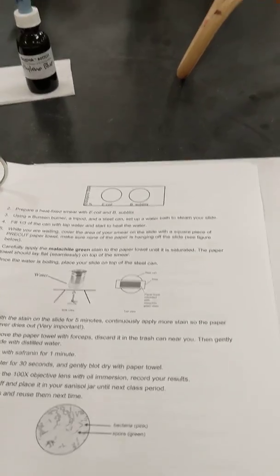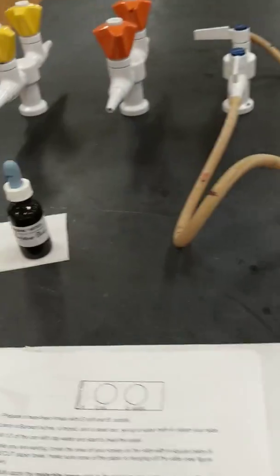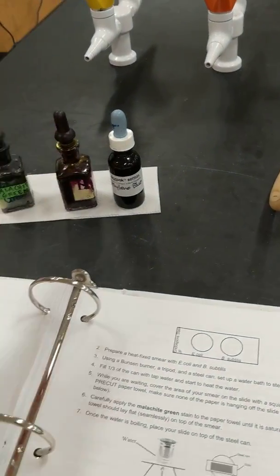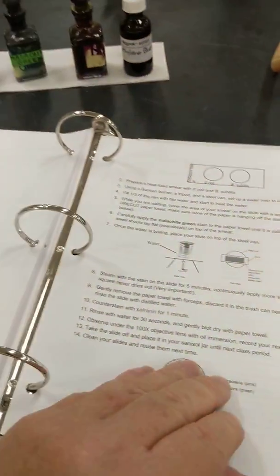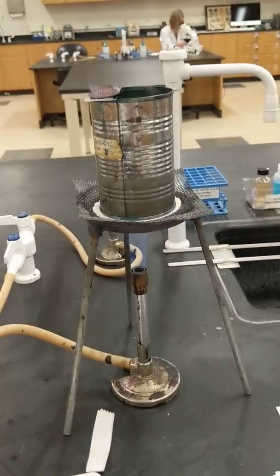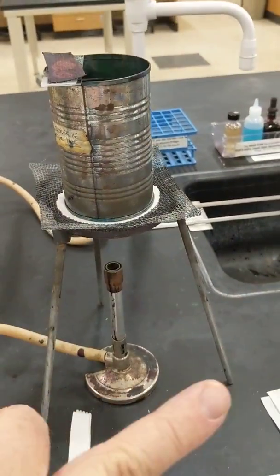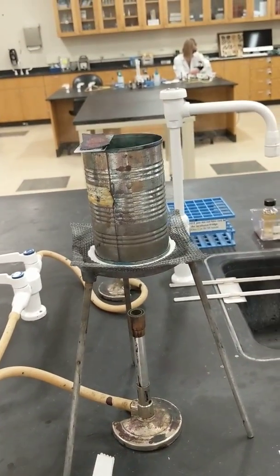Okay, and then when you're done with that, you're going to counter stain it. Again, you have your materials here. I'd recommend putting all of your additional stains in one area on a piece of paper, so that you can quickly clean up any spills. You would have a work area, you have your materials in here, and then you would have your instructions, whether you're using a laptop or your phone or whatever, have everything all set. All right? And then once you're done with this, you will turn off your flame, let it cool off, dump the water in the sink, and then go ahead and put the materials away. I hope you enjoyed your Microbiology Lab Minute.